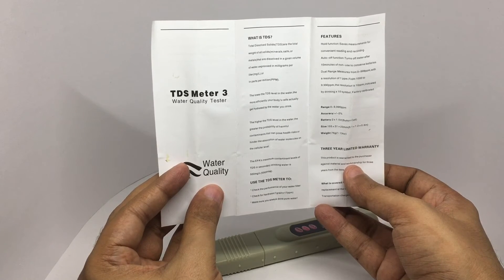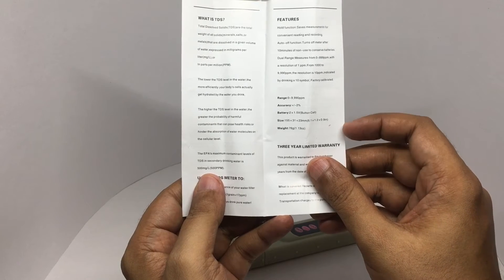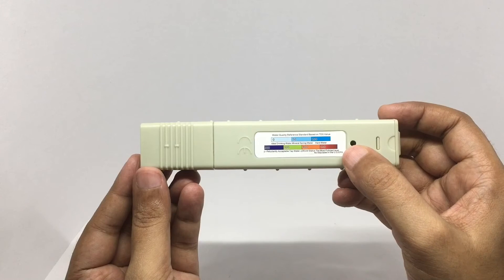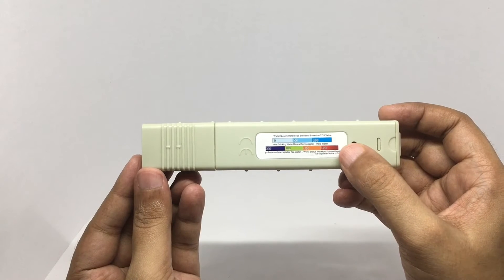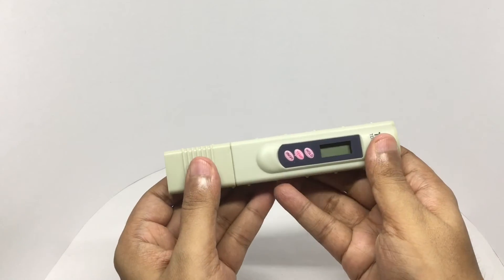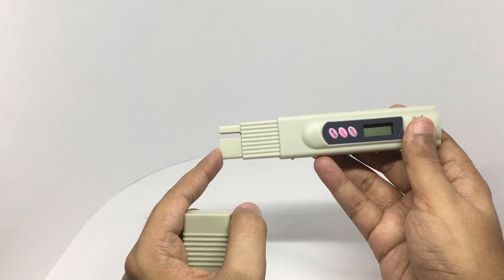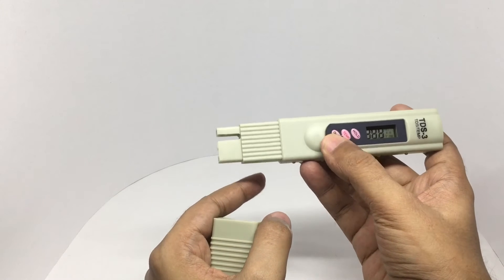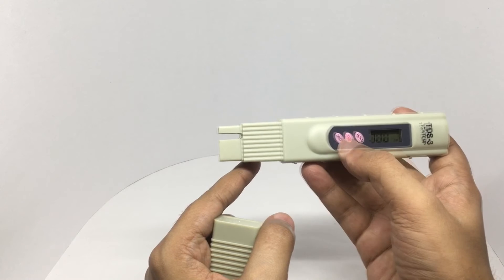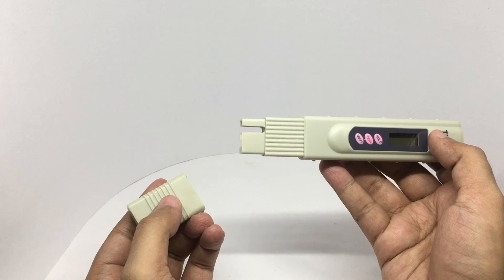It works with a button cell battery. That's the range, and that's how the meter looks — it's quite well made. There is a small graph on the back for you to study. To test the water, you open it up and dip this end in water. You can power it on once it's in water, and you can press hold to store the reading. It can also measure the temperature of the water. These are a few test samples.